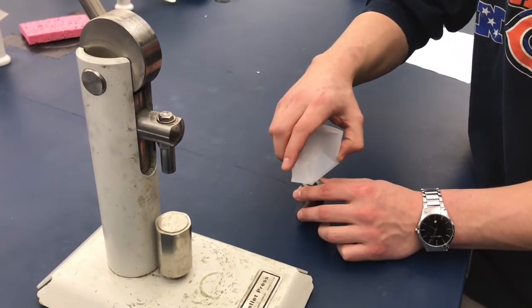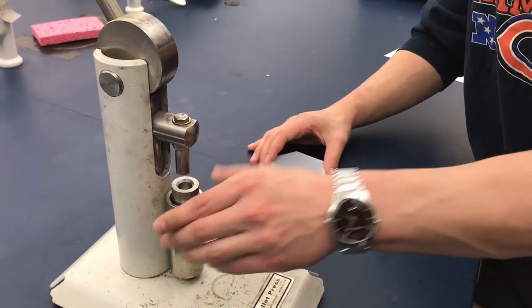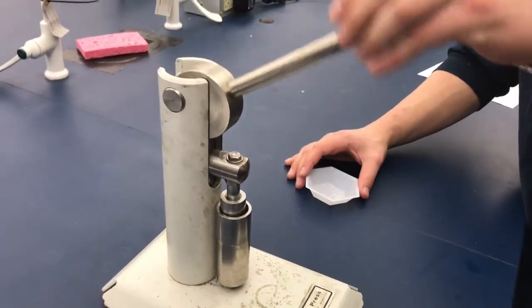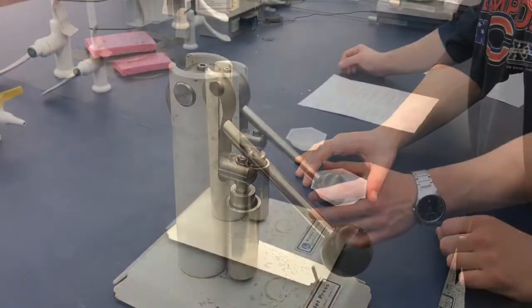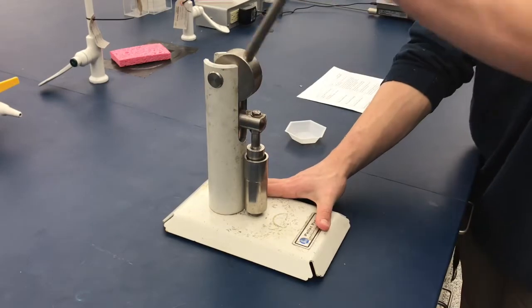Place the benzoic acid into tube number two and begin to push down on the lever of the pellet press. Release the lever and take out tube number two.